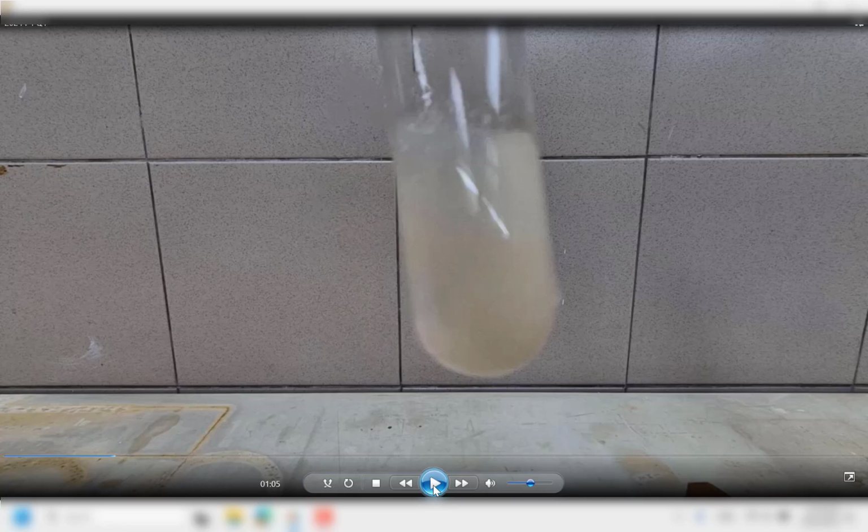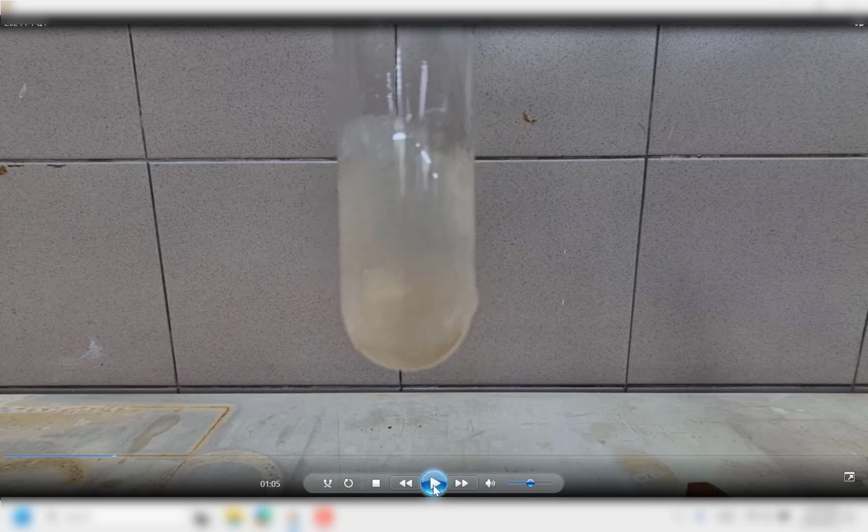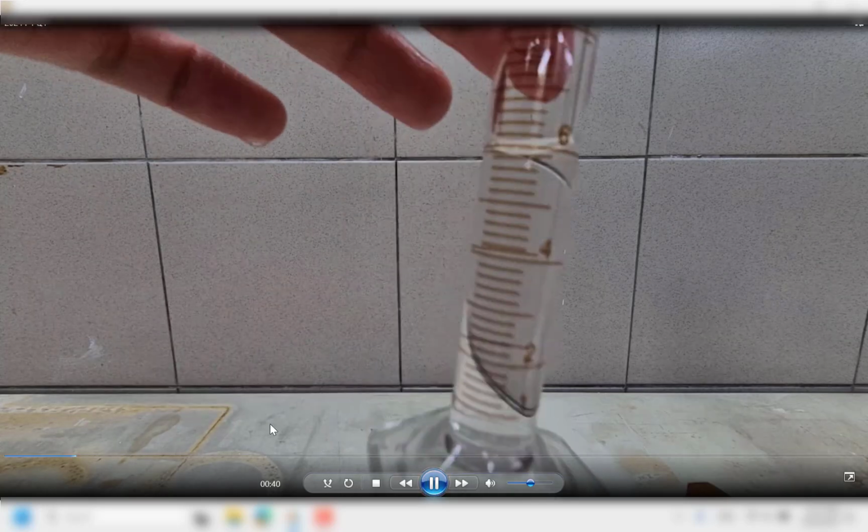and immediately the white PPT sort of gets oxidized. Let me pause here for a little while. You'll notice there is a mixture of white and brown, but you can't really tell them apart because you don't know whether the white comes first, or the brown comes first, or they come together. At this stage, the only observation you might want to record is either cream PPT observed, or white PPT, some of it turns brown, because at the beginning it's really the white PPT being produced. If I shift back a little bit, you should be able to see it. It's too far back.